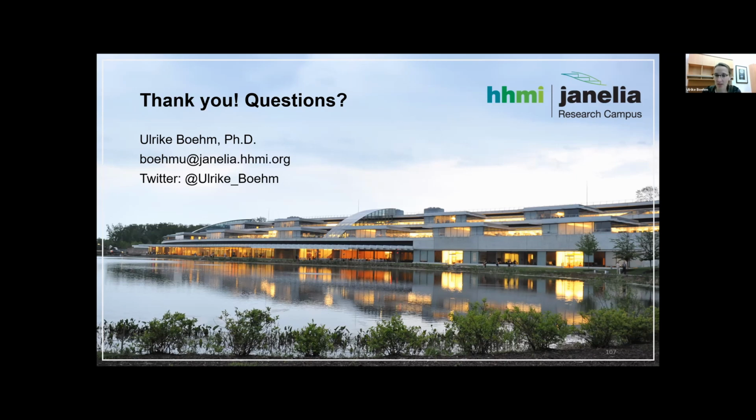In order to get what we need, meaning that the big drawback and bottleneck which we had right now in single molecule localization microscopy, meaning the processing, that will be way easier to handle. So that's one part. But I guess also, again with the dye developments, you might not need any more crazy dyes and crazy buffers which are entirely not suitable for live cell imaging. So that will hopefully also be solved over the years.